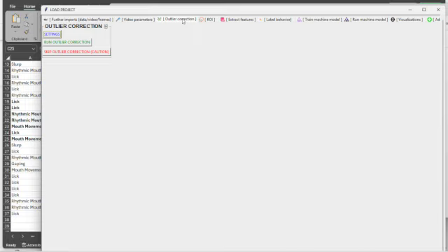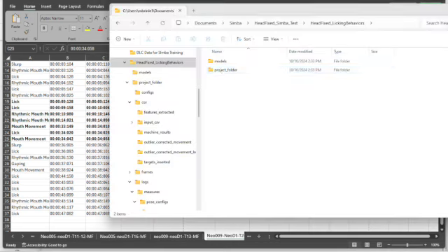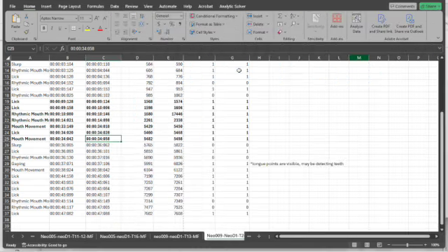One thing to note is if your DeepLabCut data has more body parts than your body part configuration for SimBA, you're going to have to go into your project folder, CSVs, and input CSVs, and select the CSV that's in there.